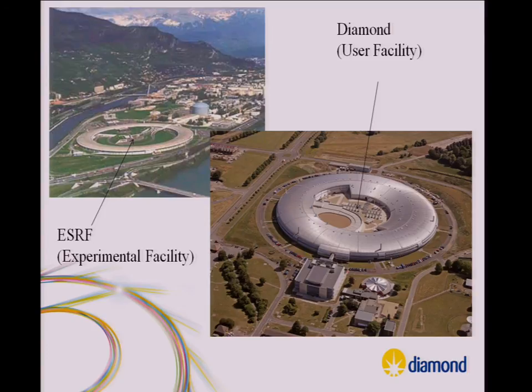Yes. So we're planning next year to start using JavaFX. You've seen the surface stuff, but what we want to do is iso surfaces. That's the next thing, and we don't want to do that in JOGL. We're fed up with JOGL. It's not the way forward. But JavaFX seems to now have a better scene graph than it did in the last version. So we're hoping to do volume rendering with that. But there's a bit of hand waving there because we haven't started on that.